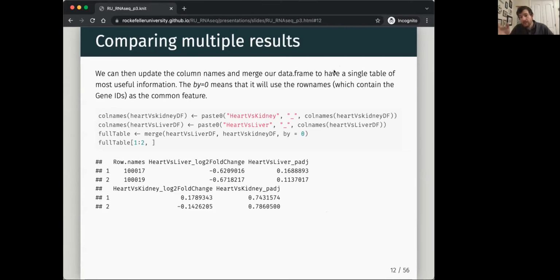And so we stick with IDs because they're straightforward and much more consistent. And I generally recommend that for your bioinformatics. Use the IDs and then just add an extra column that has the symbols. But whenever you want to do any kind of operation like matching, using the IDs is normally a stronger way to go. I hope that answers your question, Charles.